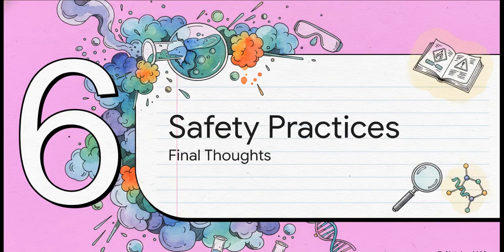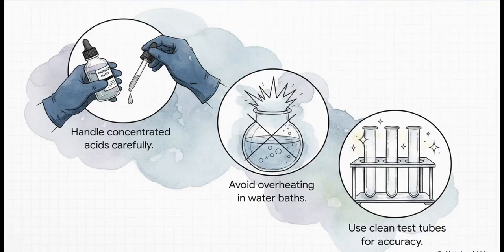All right, our final section, number 6, safety and final thoughts, best practices in the laboratory. Because look, a good detective doesn't just solve the case. They make sure they don't blow up the lab doing it. These undergraduate practicals are fascinating, for sure, but they rely on some serious chemistry, so following strict best practices is absolutely crucial.